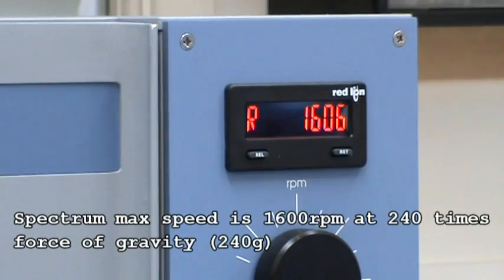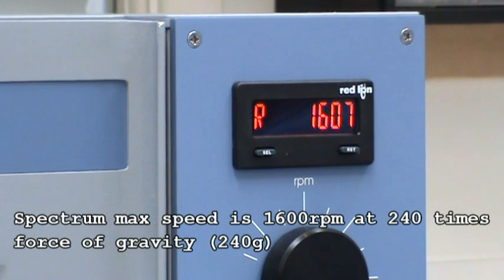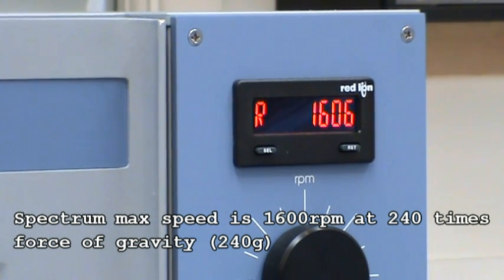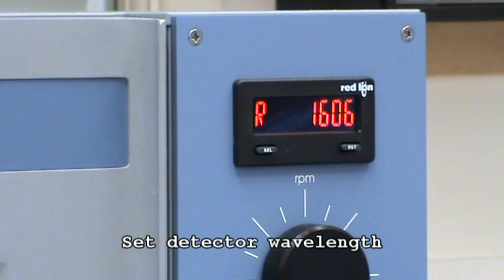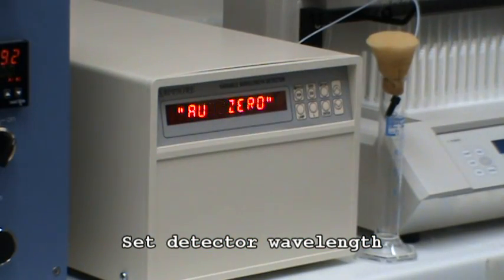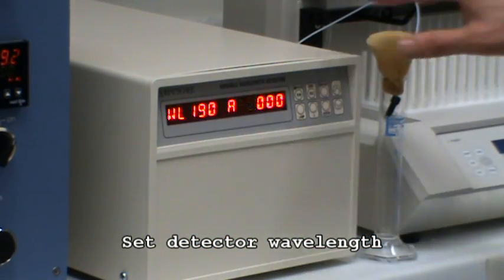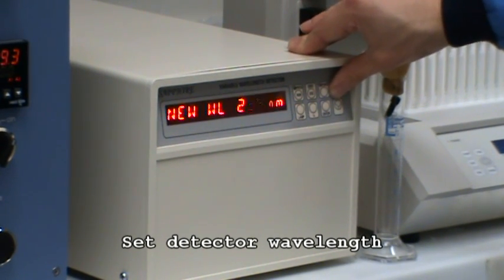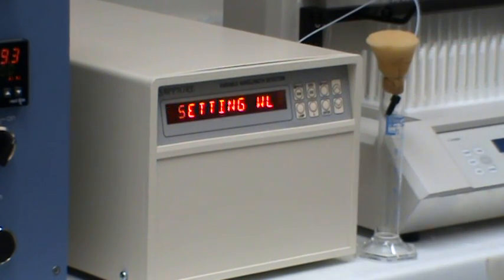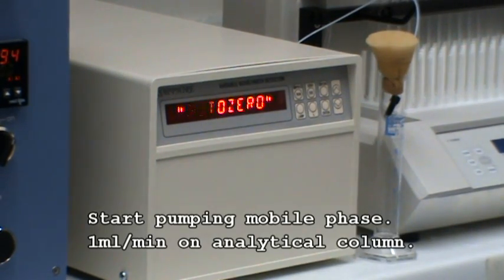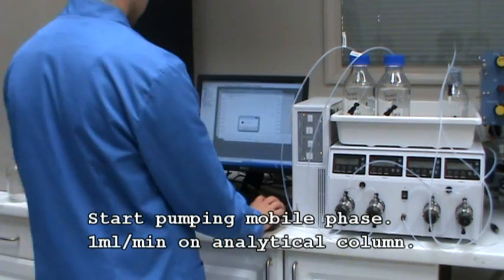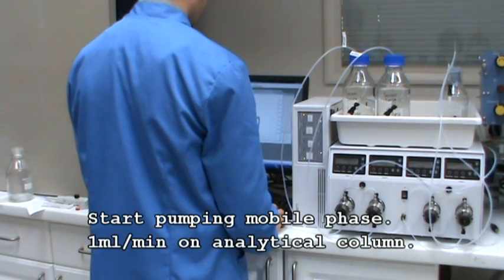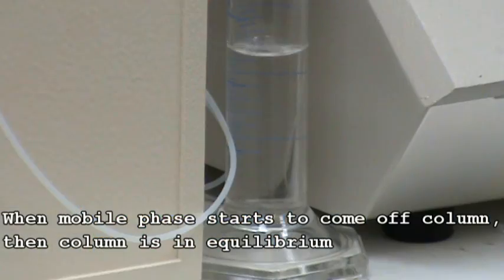The maximum speed is 1600 rpm at 240 g. Set the detector to the required wavelength, in this case 254 nm. Set your program going and begin to pump mobile phase. After a given amount of time, mobile phase will start to come off the column.